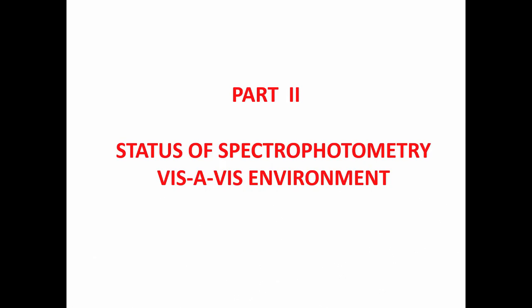And then I found out that there was a need for me to evaluate each and every method with respect to sensitivity, selectivity, and then Sandell sensitivity, and then evaluate the interferences, and then apply in actual situations to show the potential of the method. Therefore, it is very, very important for us to know a little more chemistry with respect to spectrophotometric methods, especially with the existing matrices, etc.